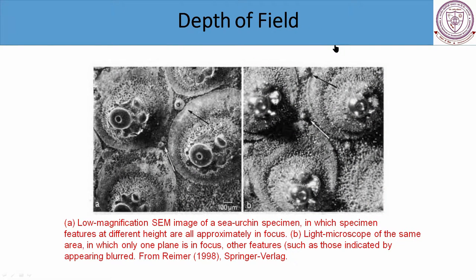In the next slide, we demonstrate the depth of field now. As I have told you, the left-hand side, that is this one, is from a scanning electron microscope, whereas the right-hand side, the same object, is from the light microscope. You are able to see a depth which is totally visible, that this is something in the interior of it, this is the top surface.